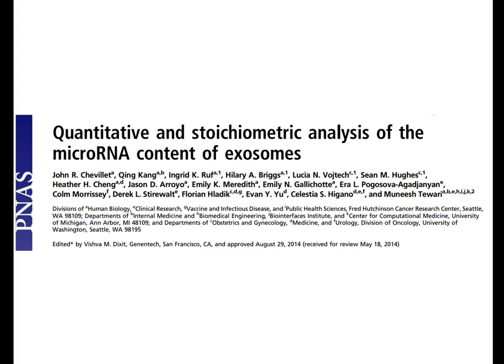So we definitely need more research there, but if you apply size exclusion chromatography to separate vesicles from plasma, also the bulk of the microRNAs will not be present in your vesicles. Messenger RNA is, but not microRNA. So you need a decent isolation method to study the true presence of, for example, microRNAs in your vesicles.